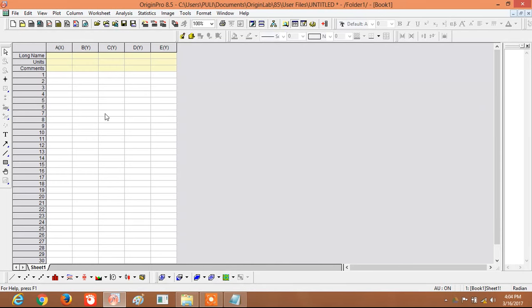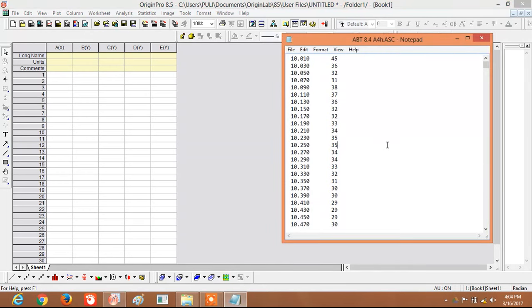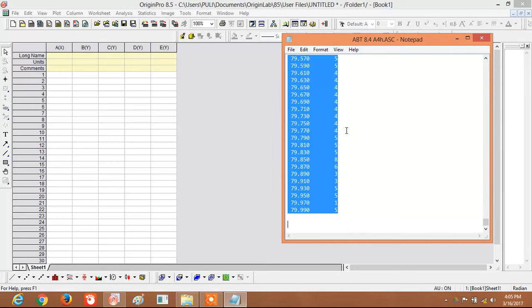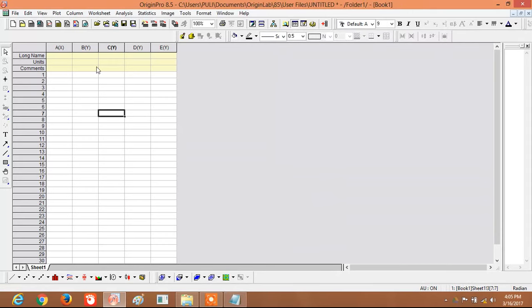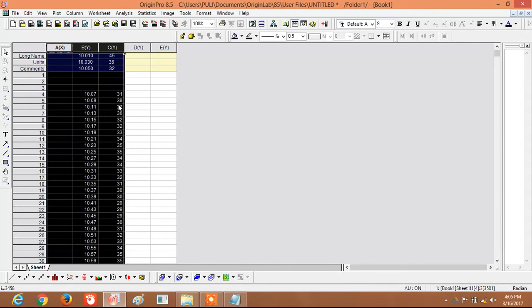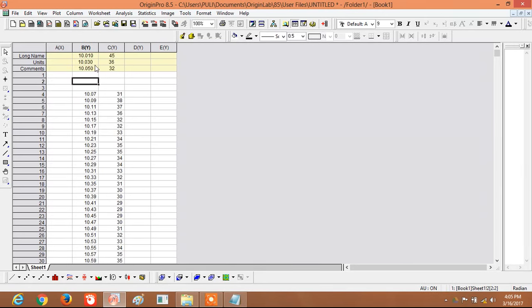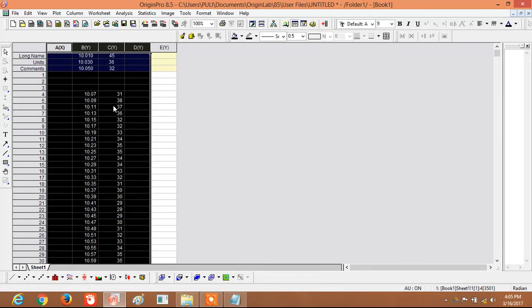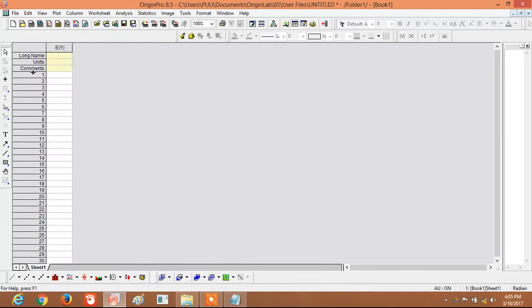One way is to copy the data and paste it — Ctrl+C and then Ctrl+V. However, when pasting this way, the data is not appearing correctly. So we will delete this and use a different method.